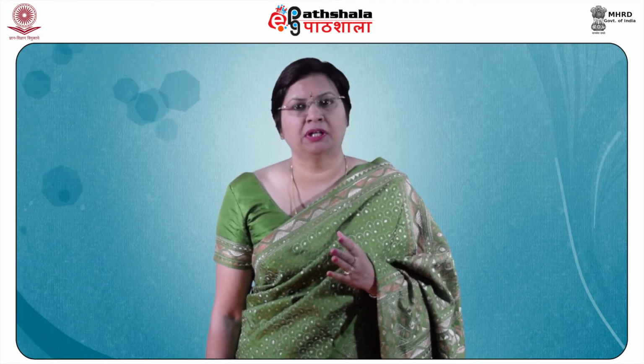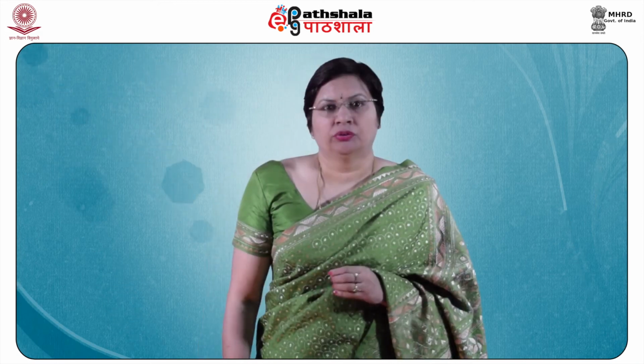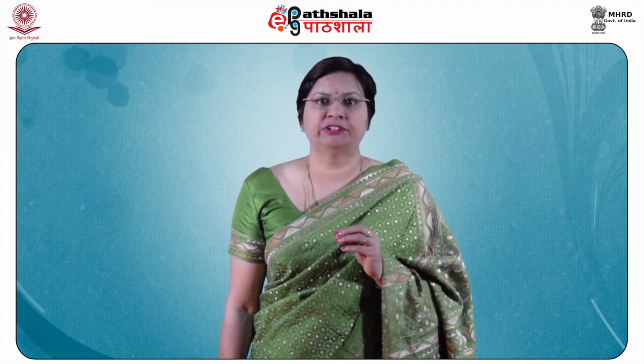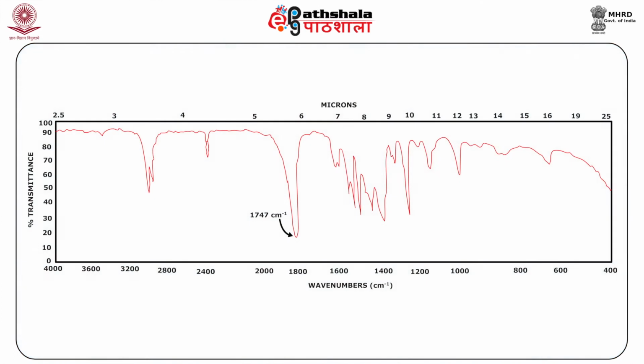The molecular formula is C5H7NO2. First of all, we will calculate the index of hydrogen deficiency, which is found to be 3. A quick glance at the IR spectrum, as you can see here, reveals the source of unsaturation as implied by an index of 3.